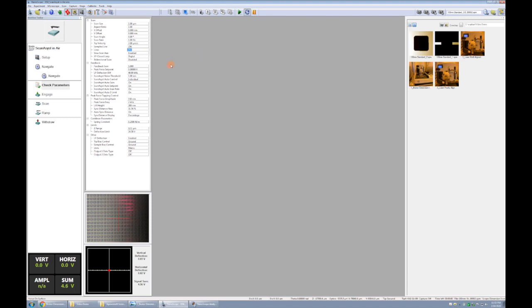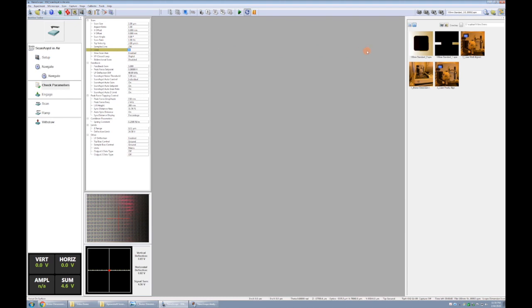Lines is just the number of y pixels in your field of view. Right now with 256 by 256, we have square pixels. That might be a good thing to do in most cases, although there will certainly be times where you might want to decrease the number of lines and make your pixels rectangular instead. This would allow us to scan in better resolution along the x while we quickly hop along to different lines along the y.